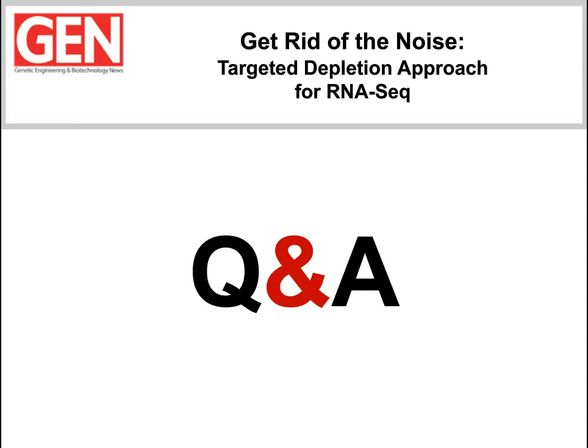A good question, especially at the lower input range. Removing genomic DNA is really important. And there are two ways that we can tell in doing our in-house experiments. In our RNA-seq analysis pipeline, we routinely look at the percent strandedness of the final library. Solo does incorporate a step to retain strand orientation. And so your strandedness should be very high, above 90%. And that will tell you that you have removed genomic DNA. If you have not, you would expect a value for strandedness closer to 50%.